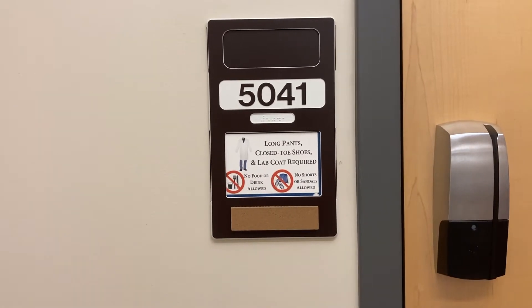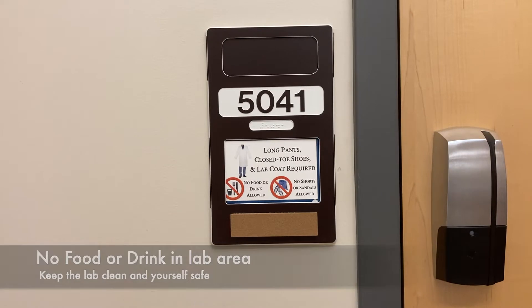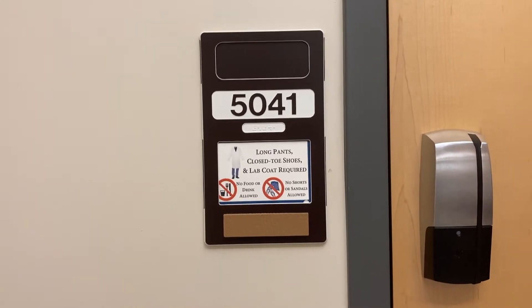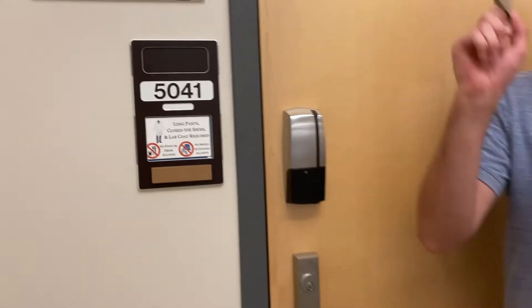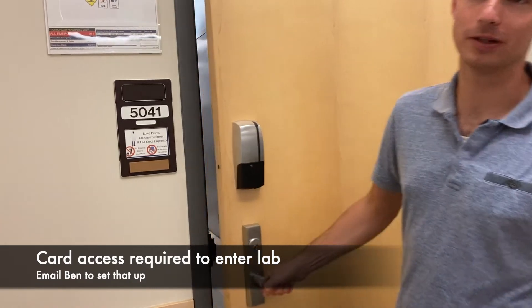Also, no food or drinks in the area. It's really important that we keep our area clean and keep you safe, not getting your food contaminated. To get into the lab, you need your ID. Your student ID is your access — just hold it over this thing, the light will turn green, and you can open it up.